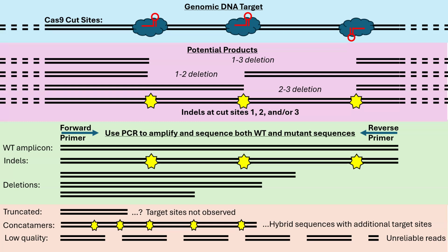Also, many of the tools we're going to use today in Galaxy were made for reads that come from Illumina or PacBio sequencing, not necessarily from Nanopore sequencing. So there may be some suboptimal things that are happening in these algorithms. We're still going to get a result, but I need to tell you all of this just so you know that it is not exactly perfect what we're about to do. But it is something that can give you a rough idea of how well you did with your Cas9 experiment.